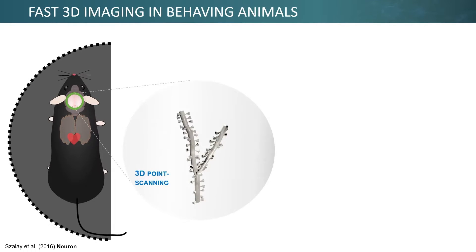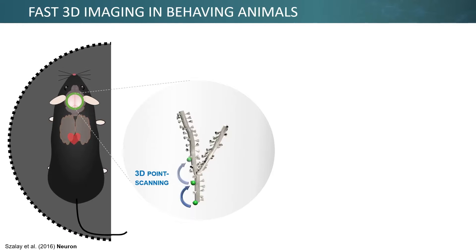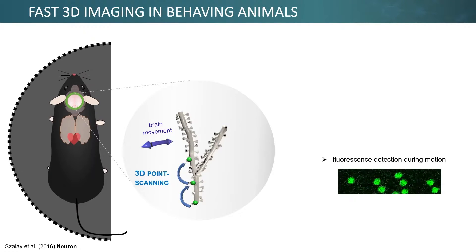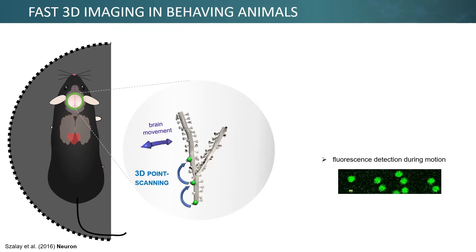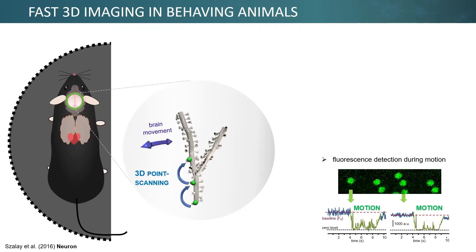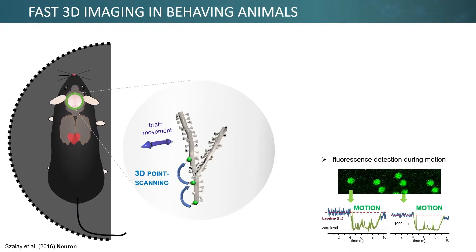But why is real-time motion correction essential in in vivo measurements? Brain movement, due to intended and visceral motion such as heartbeat or respiratory movement, can cause very large artifacts in the calcium signal, as shown on the right, especially when the ROI is relatively tight and the scanned object can move out from the scanned area or volume.